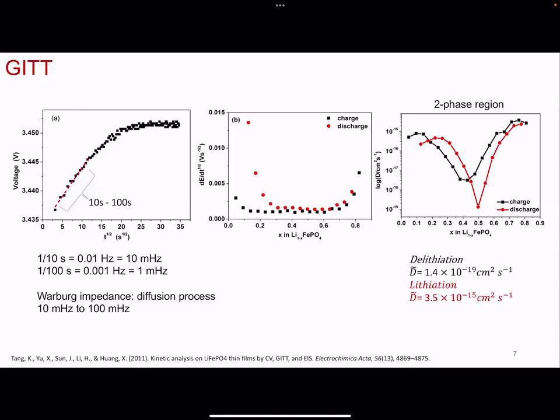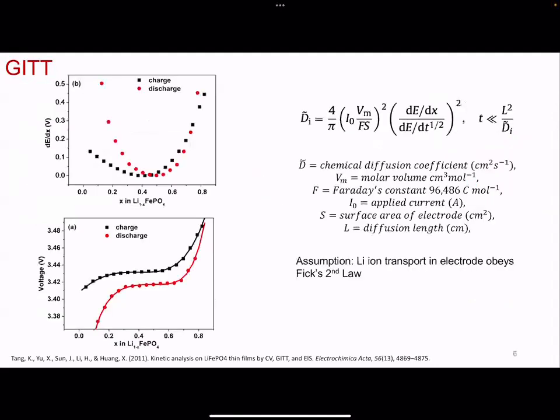All right, so already something is telling you it's probably not just diffusion of lithium ion in your material, just by looking at the time that it takes in the voltage response. Okay, but if you really wanted to, you still have these values. So you plug it into your equation, right?